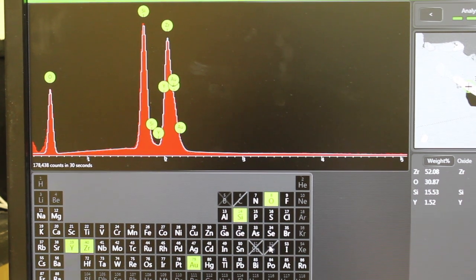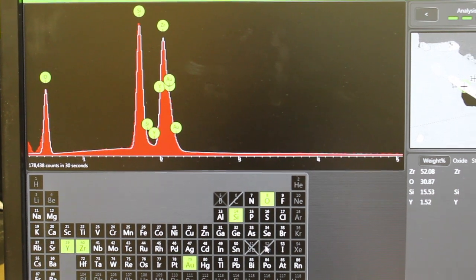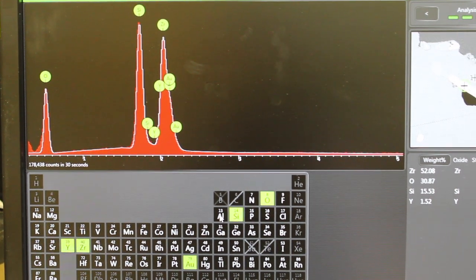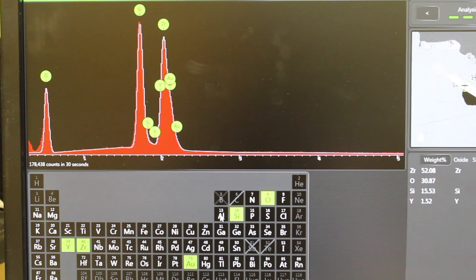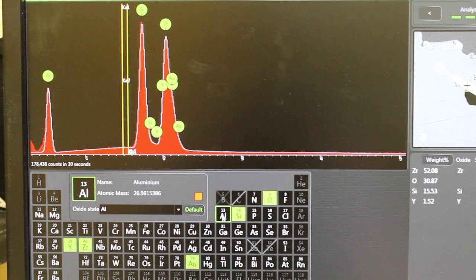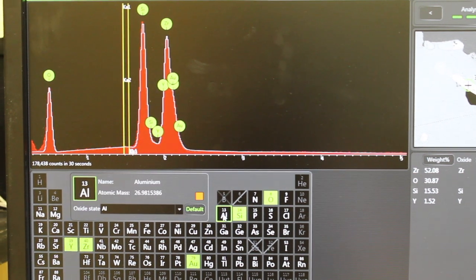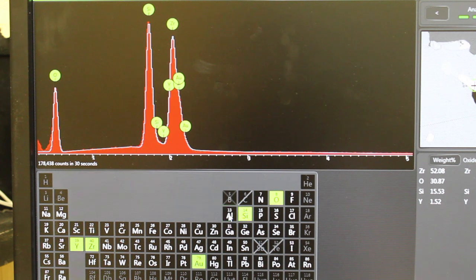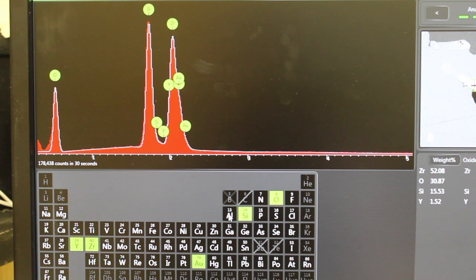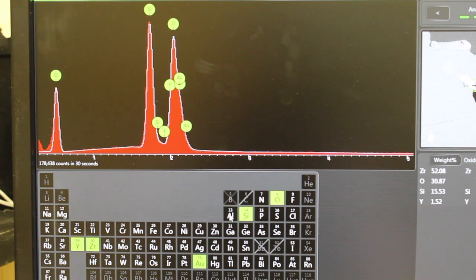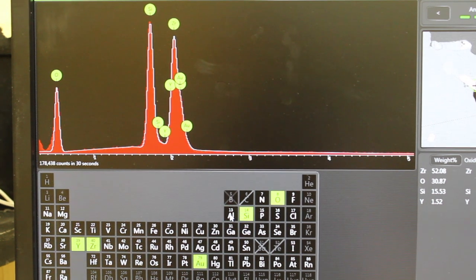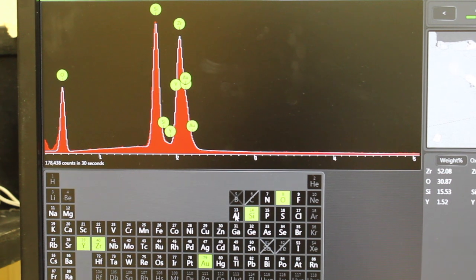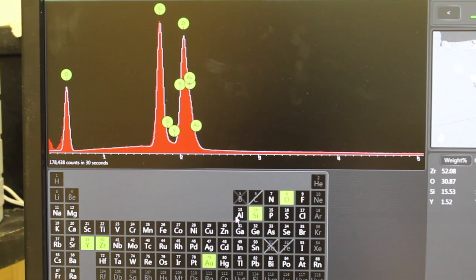We may be able to identify something else including aluminum, for example, that might fit some of the peaks better. In this case it doesn't seem like it does. Sometimes the software will just misidentify elements that don't really belong there.